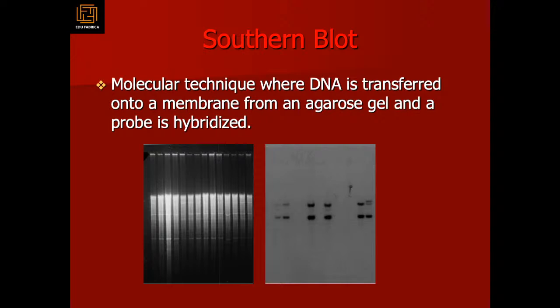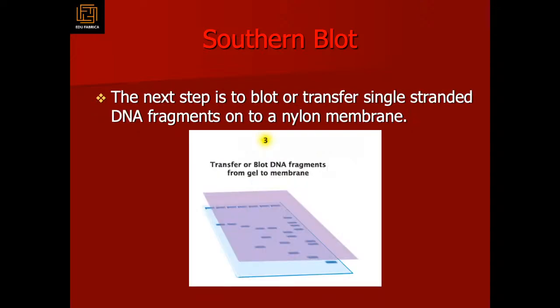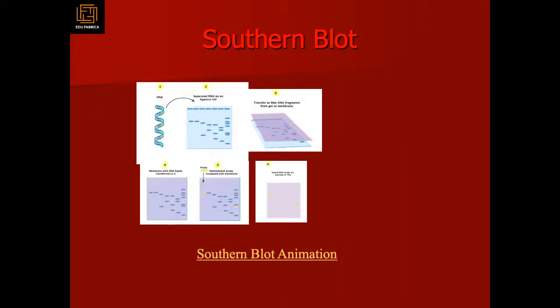It is a molecular technique where DNA is transferred onto a membrane from the agarose gel, and then we hybridize with the probe. So here the Southern blotting technique is being used. This we have done, the Southern blot.